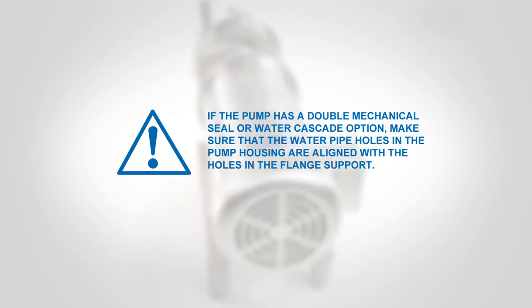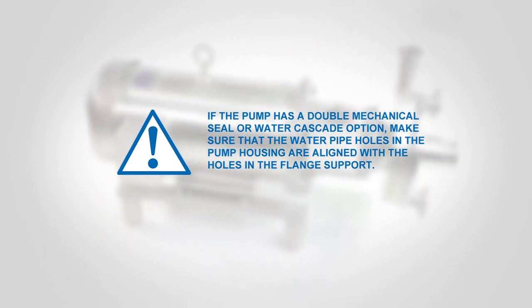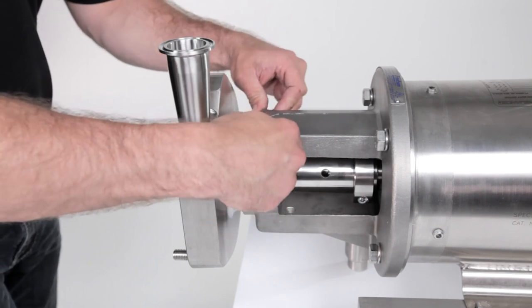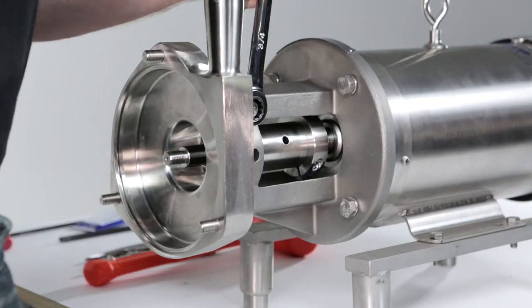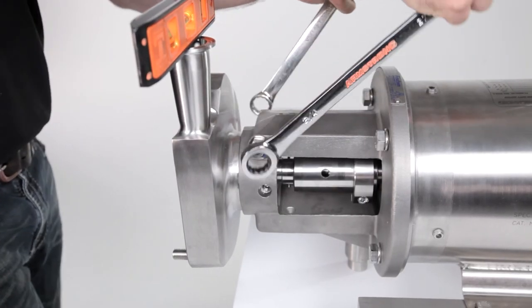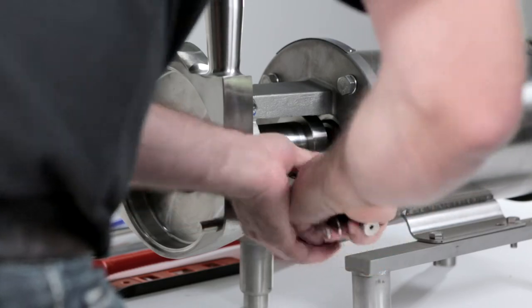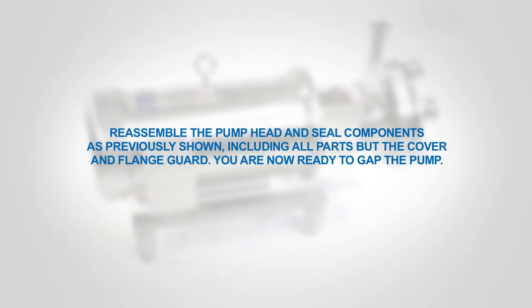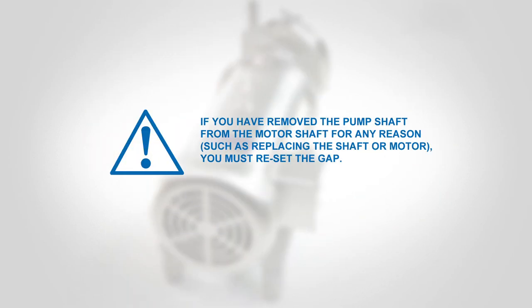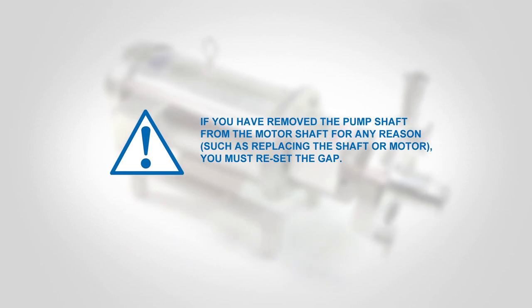If the pump housing does not slide into the flange support easily, widen the flange support by driving a screwdriver into the slot on top. Slide the pump housing all the way into the flange support until the shoulder of the housing is against the flange support. Remove the screwdriver. If the pump has a double mechanical seal or water cascade option, make sure that the water pipe holes in the pump housing are aligned with the holes in the flange support. While holding the pump housing against the flange support, tighten the clamping bolt. Install the seal water pipes and tighten with pliers. Reassemble the pump head as previously shown, including all parts but the cover and flange guard. You are now ready to set the impeller gap. If you have removed the pump shaft from the motor shaft for any reason, such as replacing the shaft or motor, you must reset the gap.